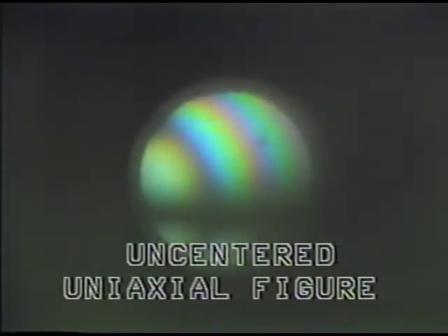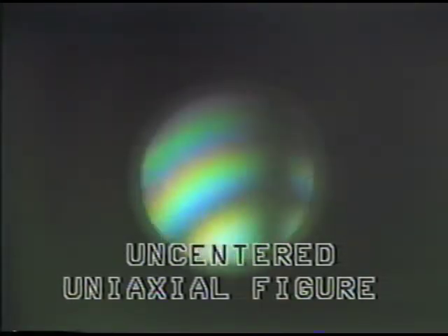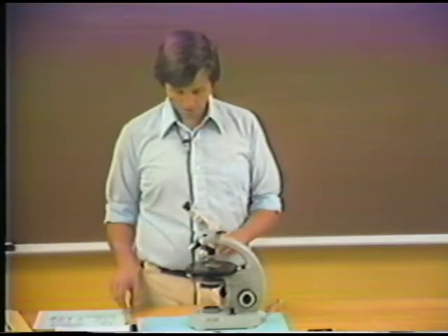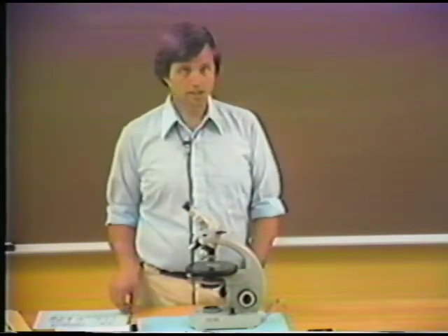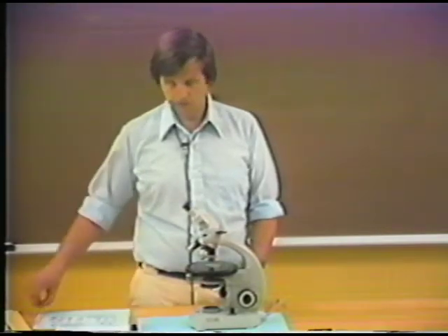That is, it's nowhere near a perpendicular kind of orientation. So we have all degrees of uncentered figures, as you would expect, and it really depends on the orientation of the c-axis. How large an angle does the c-axis make with the stage of the microscope? This is what governs the character of the uncentered kinds of figures.